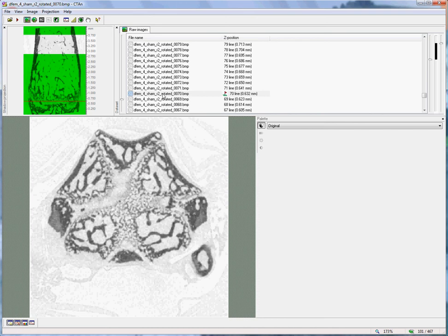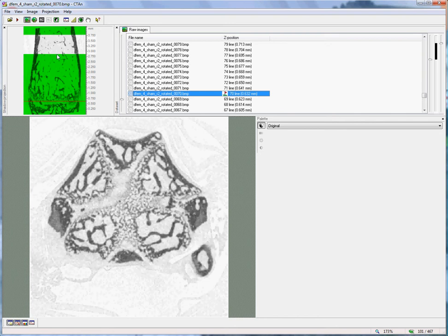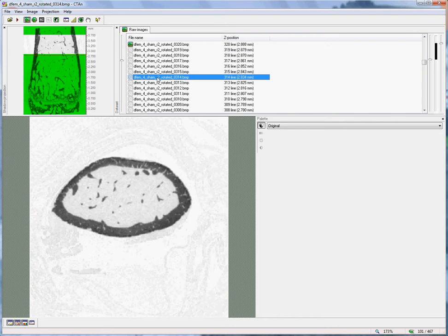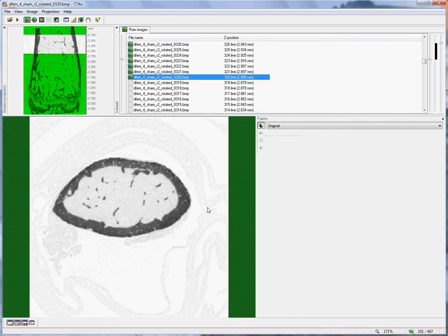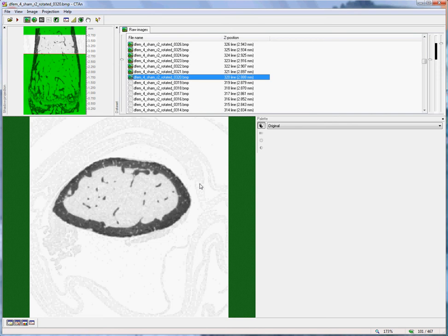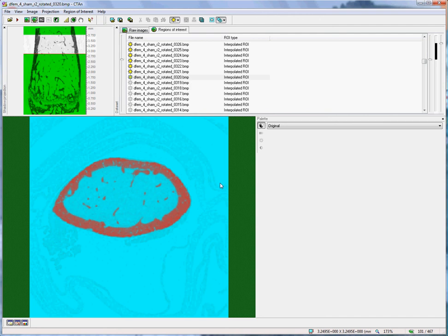So, having determined our vertical range, we then travel to the bottom of that selected range and proceed to delineate a region of interest for the cortical bone. We move to the region of interest page of CT analyser. What we want to do here is to make a hollow region of interest which excludes most of the trabecular bone in the centre.